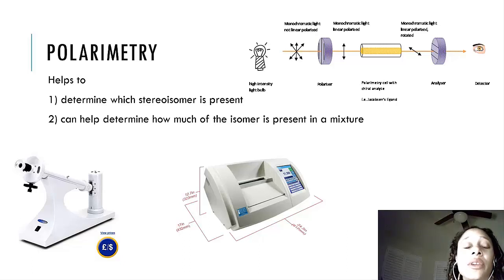Now, most of our other instruments can't detect that, but we have an instrument that can detect how it shifts the light around. So the basic idea of a polarimeter is that if you shine light through a sample, you just see the light, right? The problem is that light gets scattered by molecules very much. Specifically with chiral molecules, it shifts the light, but because light is already going in 1,000 different directions, we have to be able to measure this, and this is what the polarimeter does.